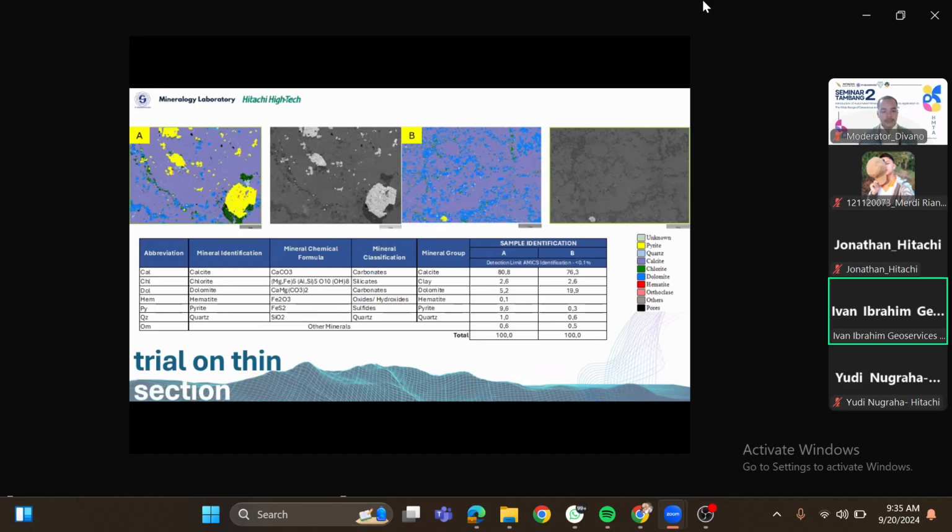Dari sayatan kita dapat tekstur, dari AMICS kita bisa dapat kuantifikasinya, bahkan kuantifikasi visual porosity, dan data mineraloginya itu esensial untuk menentukan bukan hanya mineral batuan ya, tapi juga post depositional proses atau diagenesis. Kalau di batuan kita bisa tahu paragenesanya dari tekstur juga mineralnya sendiri gitu.